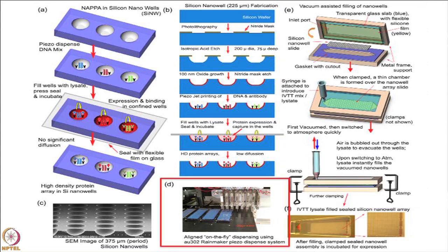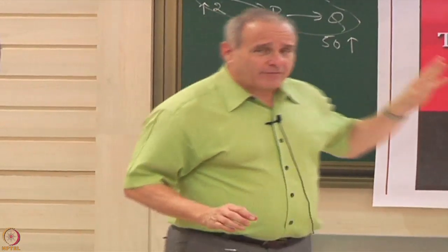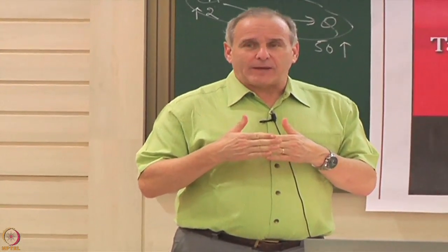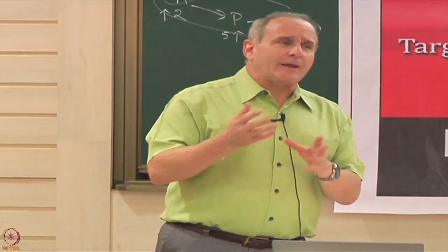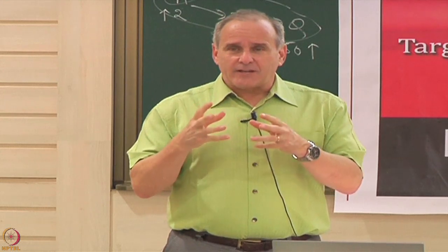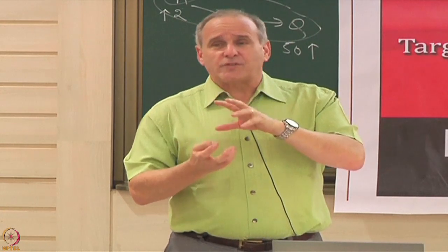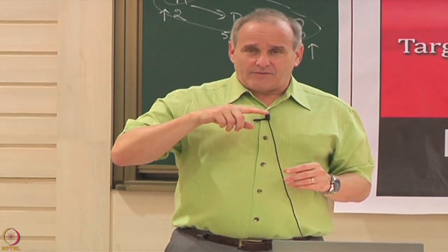This is the piezoelectric printer, by the way, that's doing the printing, and these are these special piezoelectric nozzles that are very accurate at delivering fixed volumes to each well. One added benefit for those of you who are NAPPA aficionados is that with these nanowells, we have figured out a way to print the print mix separate from the DNA mix. So one of the things that you may not appreciate, when we print normal NAPPA, it has a cross-linking agent in it. And the cross-linking agent is meant to capture the DNA and the protein BSA to the surface of the slide so it stays put. The problem with the cross-linking agent is that there's a time function attached to it.